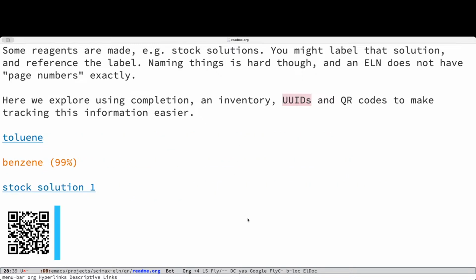So that's sort of the main idea today. I think there's a lot of potential here. I've been playing with some Arduinos and Raspberry Pis that you can communicate with by Wi-Fi. I have not figured out how to communicate with them by Bluetooth, but I'm pretty optimistic that we can set up a two-way communication where scimax will communicate to a device, ask it for a QR code, and then the device will return it back. I'm 100% sure we can do that by REST API with a Raspberry Pi.